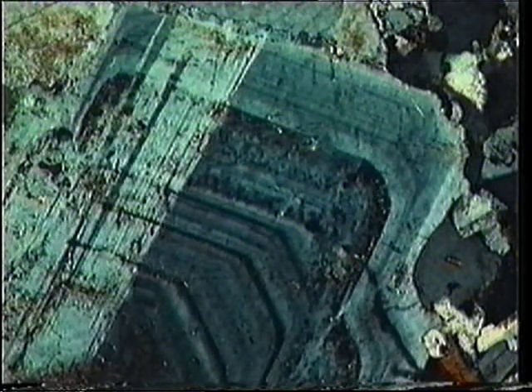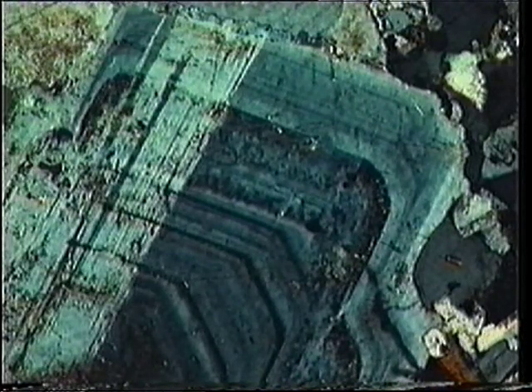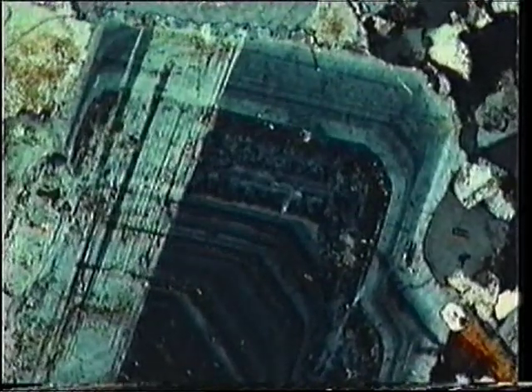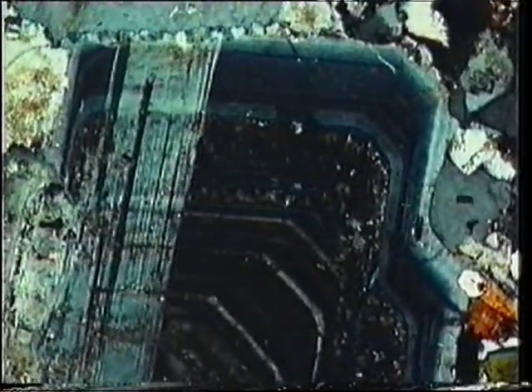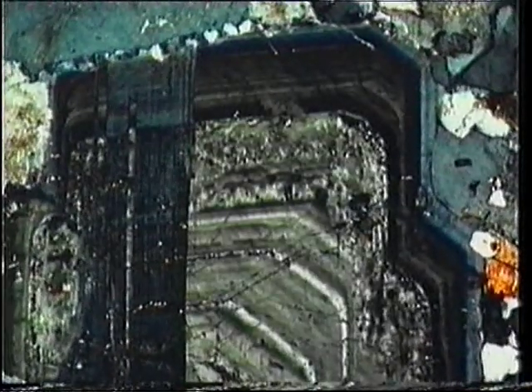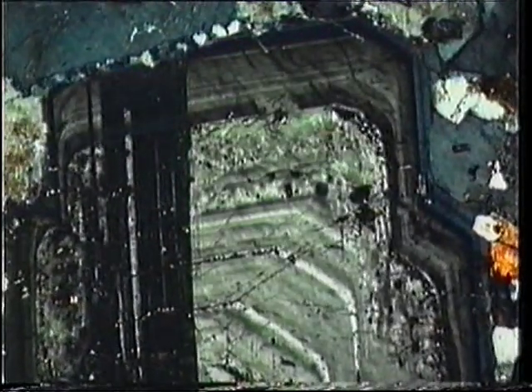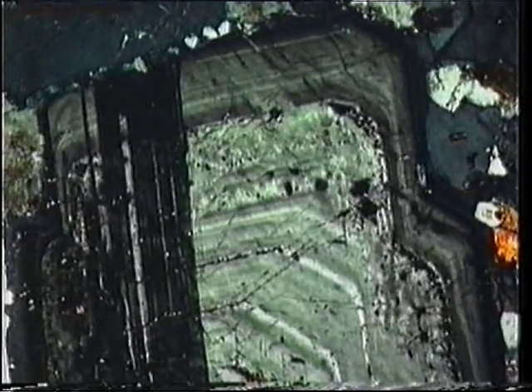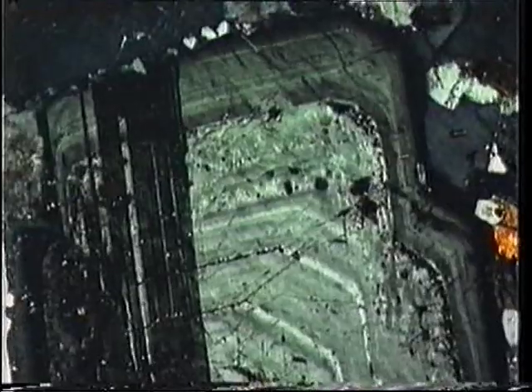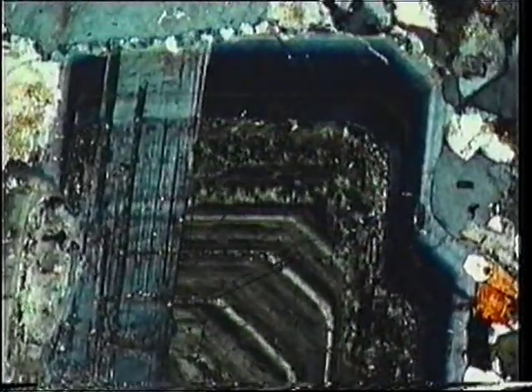Plagioclase composition can also oscillate rapidly, resulting in sharply defined concentric zones which mark the former positions of crystal faces. Normal zoning is also present here. Notice how the extinction angle changes progressively from the core to the rim. Oscillatory and normal zoning are common in igneous rocks.